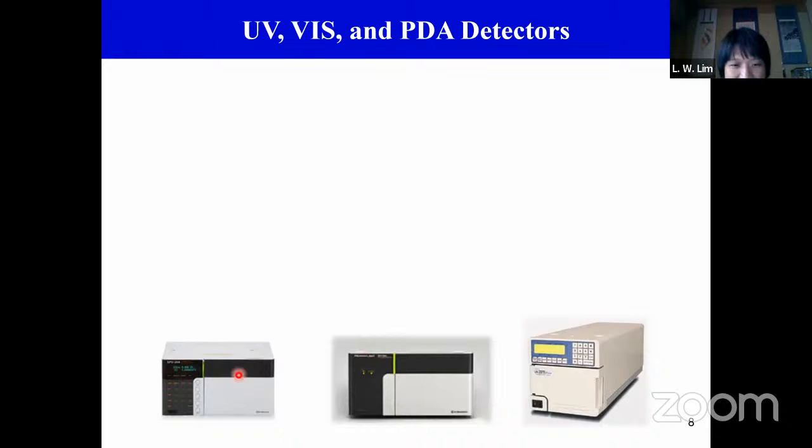If you look at this color, this is a very standard color for Shimadzu. In my lab, we use this detector by Jasco. Jasco, not the shopping mall Jusco. This Jasco is JASCO. In Japanese, it's called Nihon Bunko. Nihon means Japan, Bunko means spectrometer.